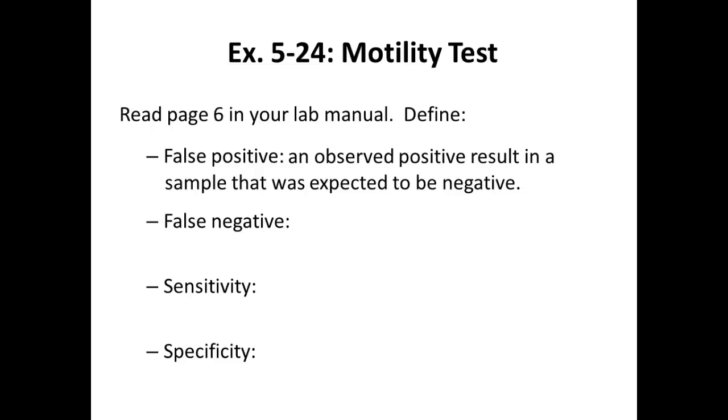How would you know you got a false result? Right? We run controls, right? And that's why I have ones for you. And that's why sometimes we'll run multiple tests and why we have to take into consideration how the tester performs in the particular things that could potentially go wrong. Okay?